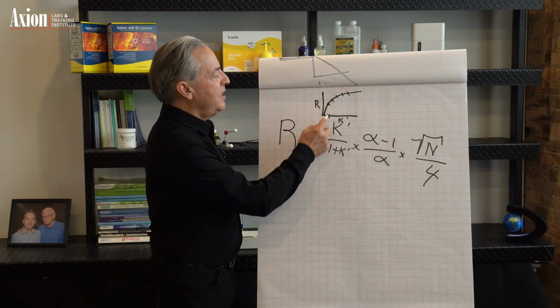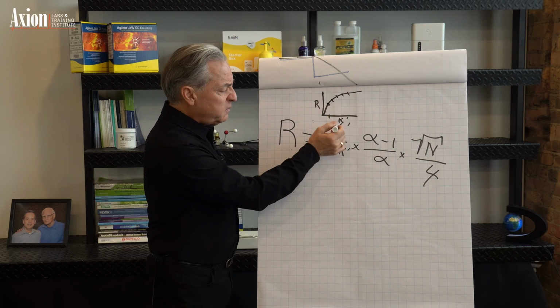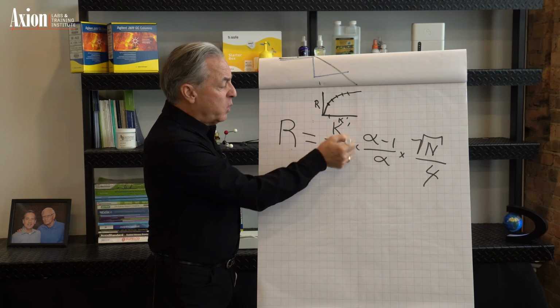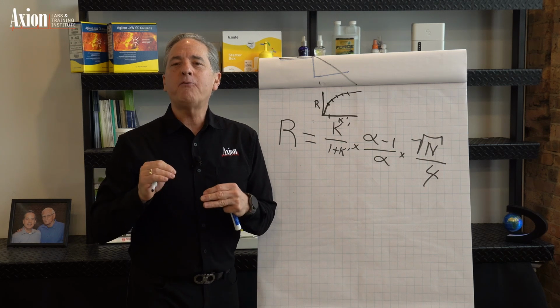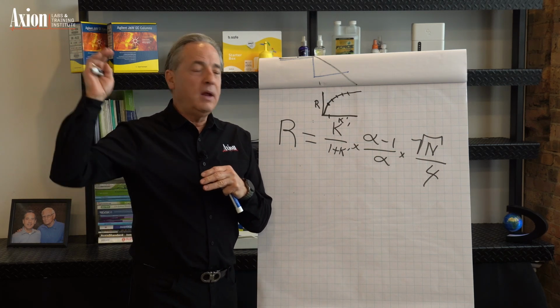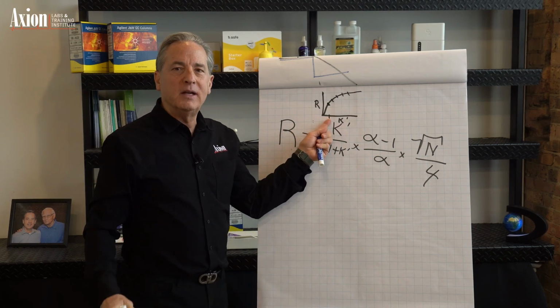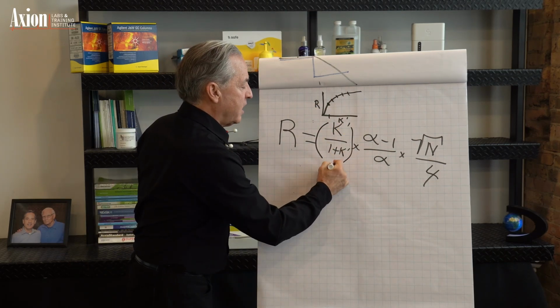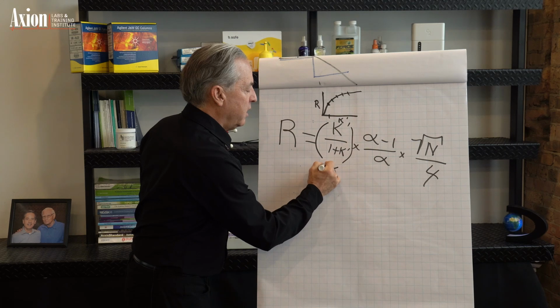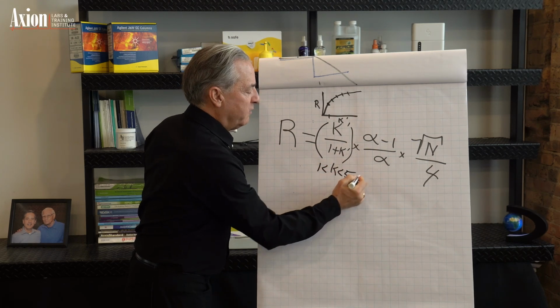We look at that, we say, if you've got a capacity factor of 1, 1 over 1 plus 1 is 2. So 1 over 2 means this number is 0.5. You're halfway to the ultimate number, and it only took a few minutes. So that's where capacity factor of 1 comes from. So we say capacity factor should be between 1 and 5.